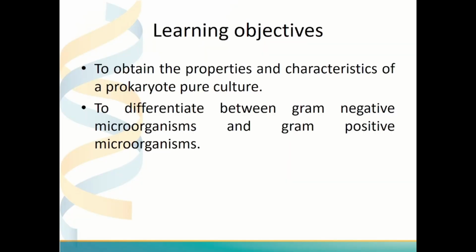So the learning objectives of this presentation are to obtain the properties and characteristics of a prokaryote culture and also differentiate between gram-negative microorganisms and gram-positive microorganisms.